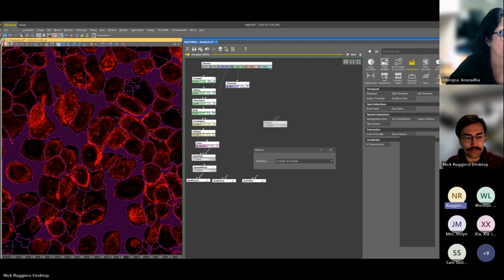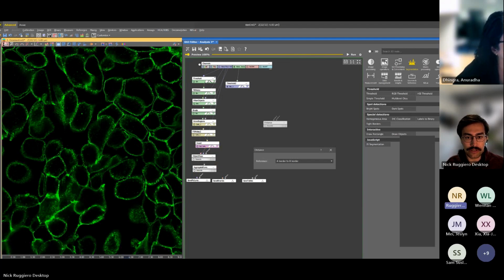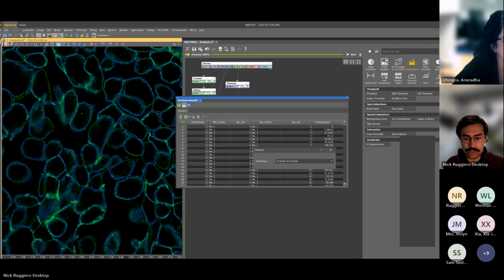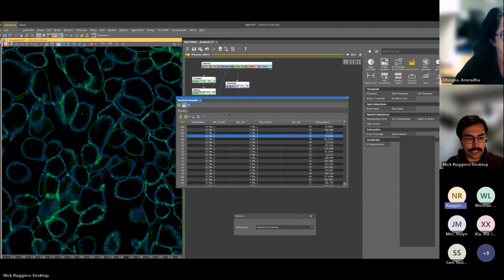Let's deactivate this so it doesn't pop up every time. So let's look at that channel real quick. We'll turn this off. I haven't done any pre-processing on this, so I don't know exactly what it's going to look like, but maybe we do something like that. We run some smooths to get it to look nice. And then I'm not sure exactly what this is going to look for. Layer 1, layer 2. So this is going to give us a distance measurement.